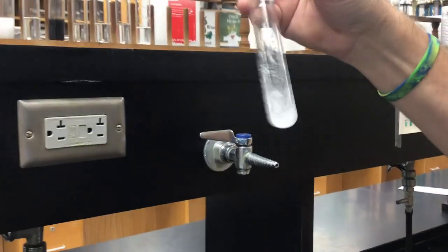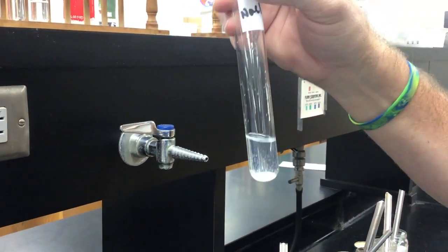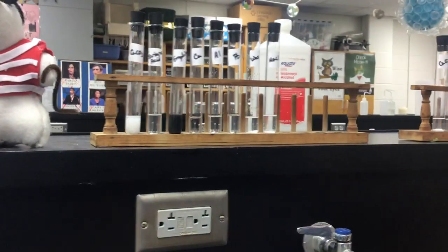And then the table salt. Still see some salt in there. Now you're free to write, you know, slightly soluble or not soluble on there if you want. We just really want you to write your observations, what you think. Let us know what you think about what's going on.